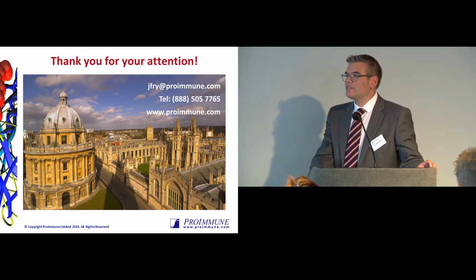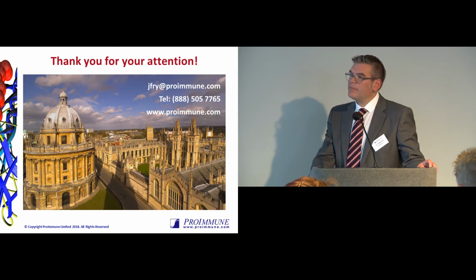Hi, Jeremy. Great overview. Just a question on your assays where you look at T-cell activation, especially for the storm and other things. When you do that characterization of the cytokines, do you also go a little deeper and look at the kinds of T-cells being activated, whether they're central memory or effector memory cells?